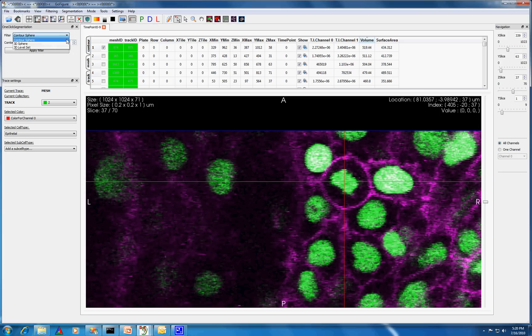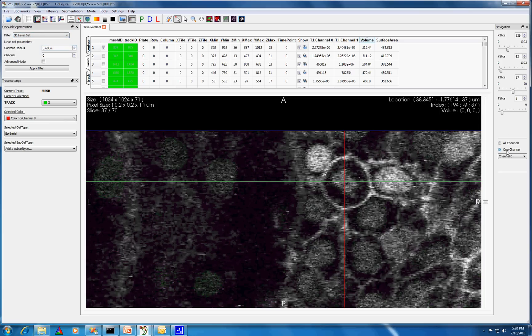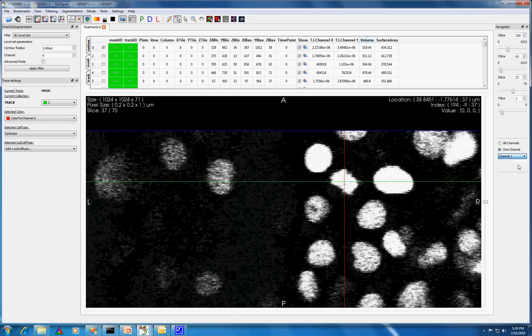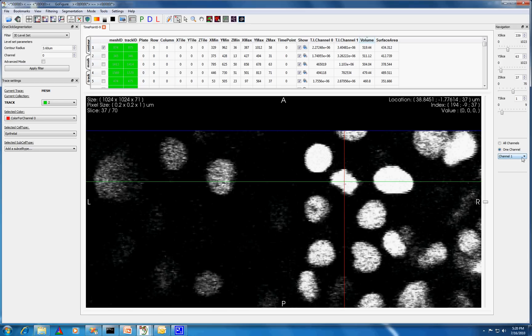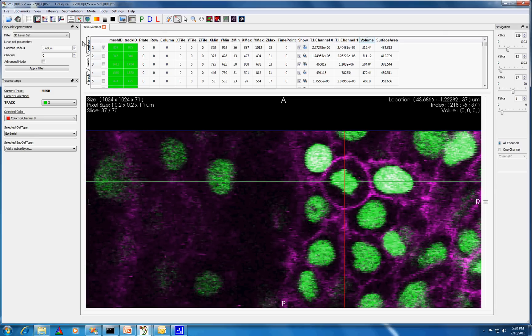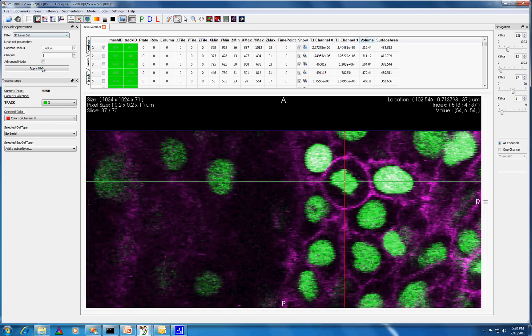Next, I check which channel corresponds to the nuclei using the navigation widget. For this dataset, channel 1 is the nuclear channel. Once these parameters are set, I can choose the centroid of the nucleus and then go ahead and click Apply Filter.